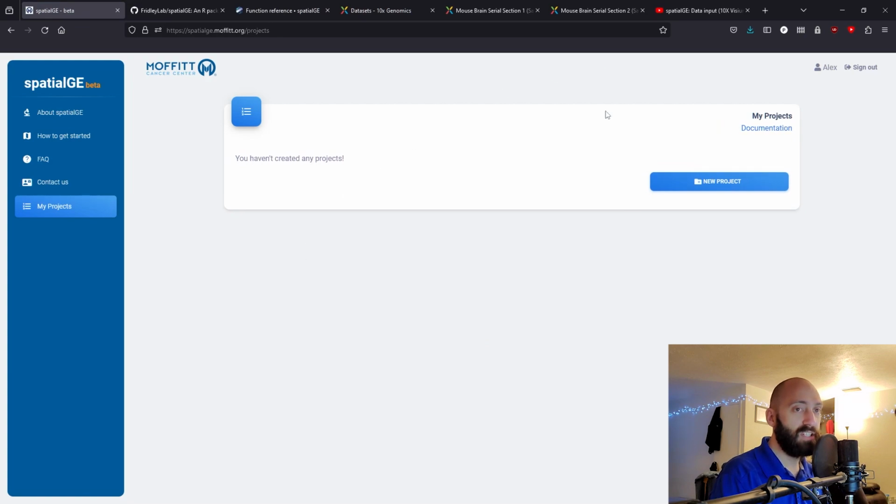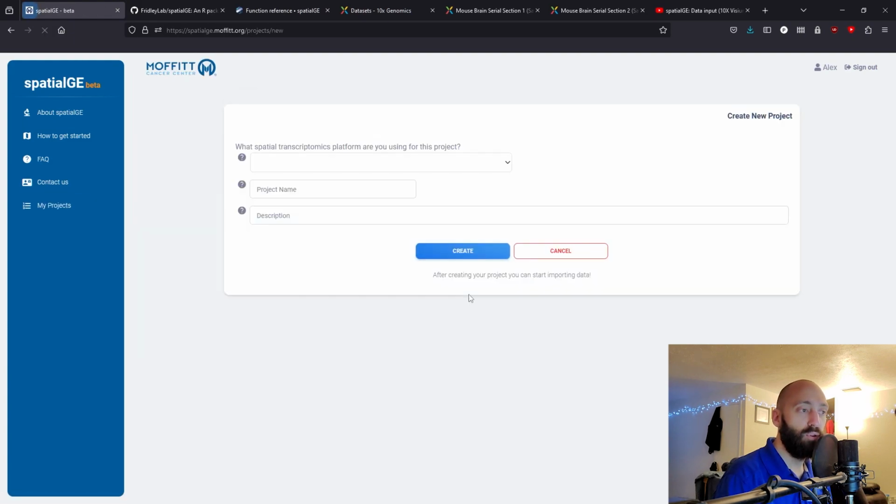So we don't have any projects yet. You'll have to sign up, and when you sign up, you're going to get an email that will have you click a link, and by doing that, you are kind of activating your account, so to speak. But you can't just sign up and then start using it right away. You have to sign up, wait for the email, and then click the verification link. But what we can do is start a new project.